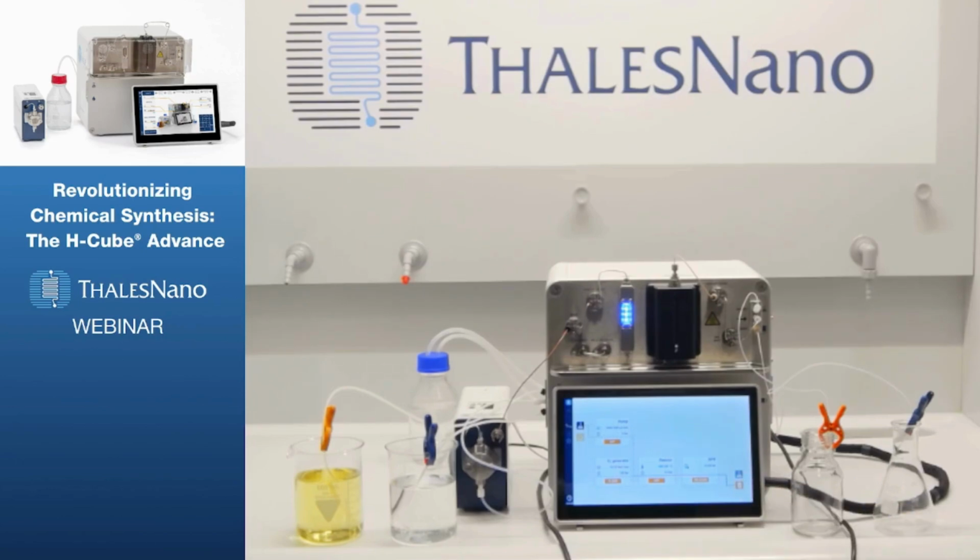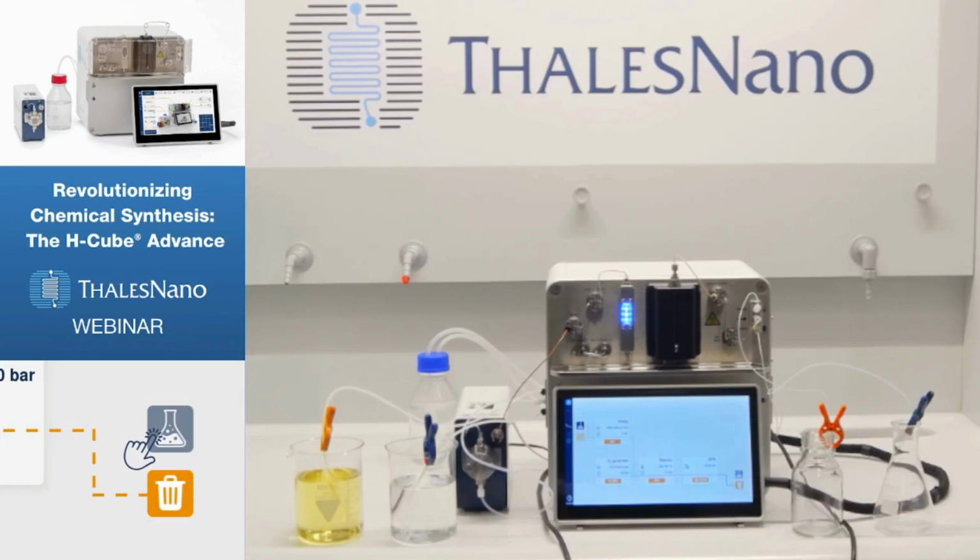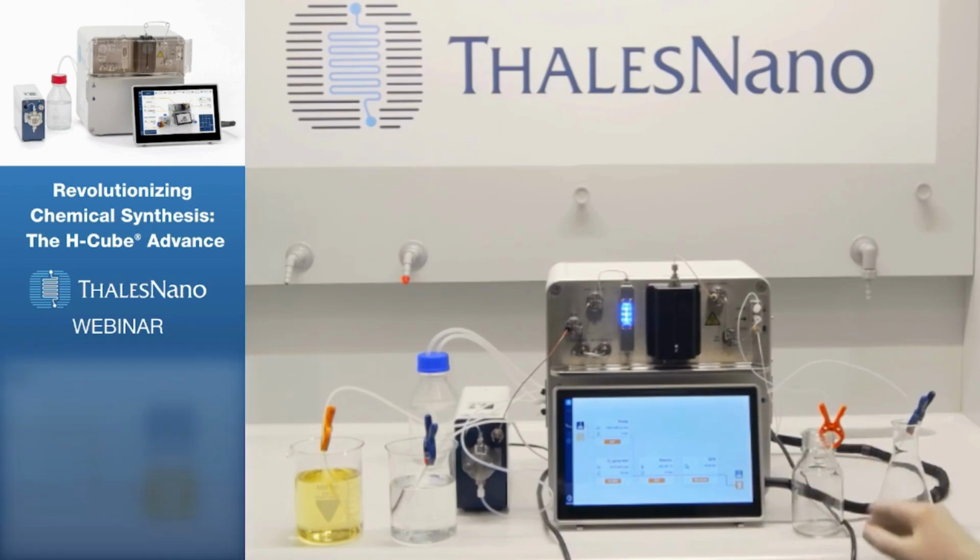Actually, you can also do it now, because you are just collecting 2 minutes of clean solvent in addition to the already collected material. But if you really want to wait for the material to appear at the end of the flow path, you can wait 2 or 3 minutes. That's the dead volume of the system. Then you can start collecting the product by pressing the product button. That will switch to this flask, which is empty at the moment. That's where we will collect the solution of the product.